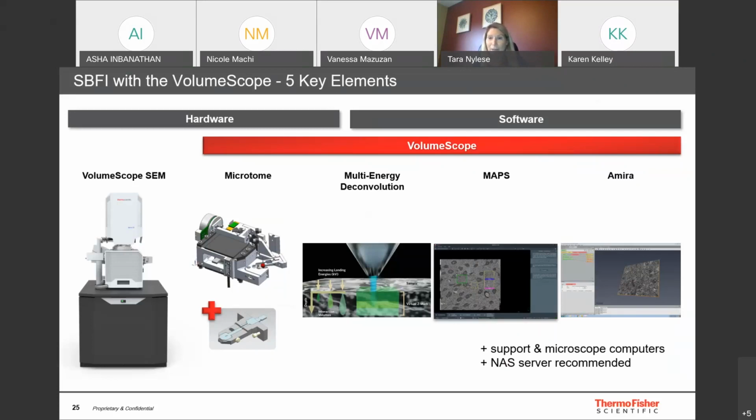And then finally, pair it with a data reconstruction package to do your volume rendering or your 3D investigations, to do quantitative measurements and, say, figure out what your volume fraction of mitochondria in cardiac tissue is, and so on. And then, of course, this is where the high data storage comes into play. So we do have hardware set up to support this: additional data servers and collection capabilities so that all of your data is preserved.